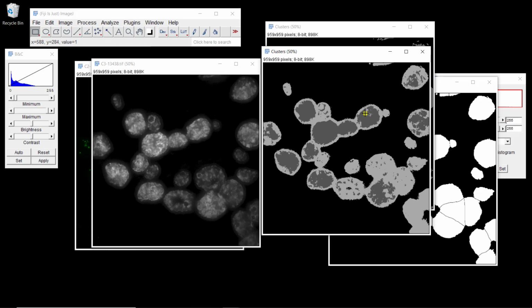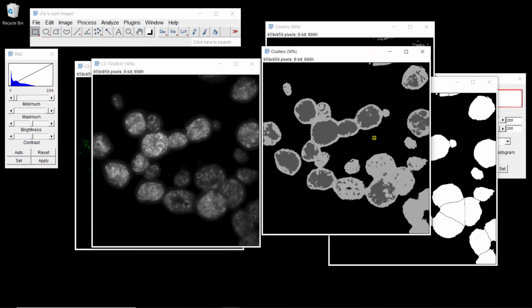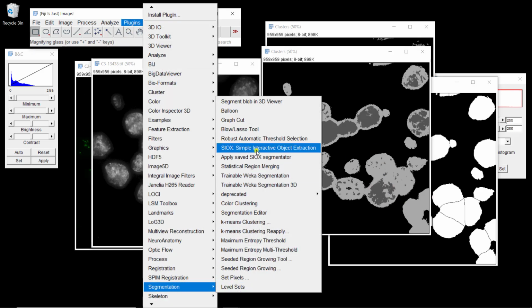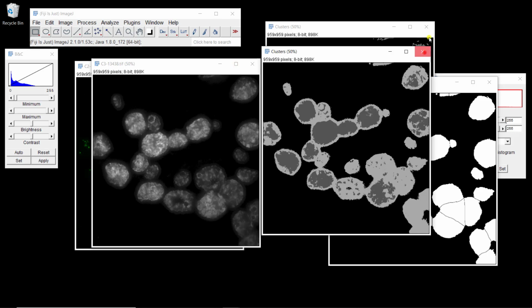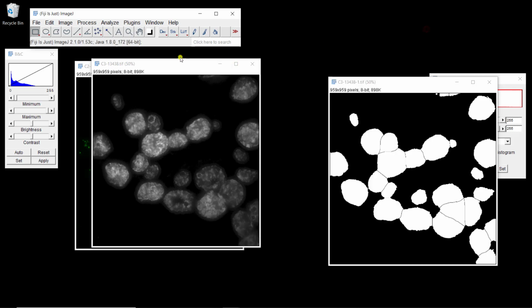But it's very similar to here. We're going to end up with the same problem: we have one big structure that's going to be split into 4, unfortunately. Let's just try one last k-means clustering, because when we increase, maybe it can help. So with 4 clusters now, that's not going to help. Let's try something else. Maybe we can try a scale-based approach. Let's do a difference of Gaussian.